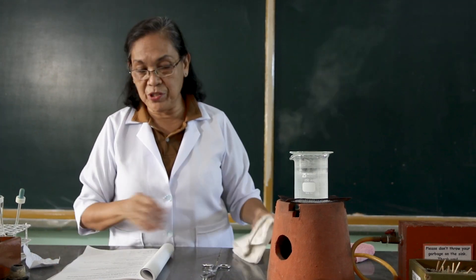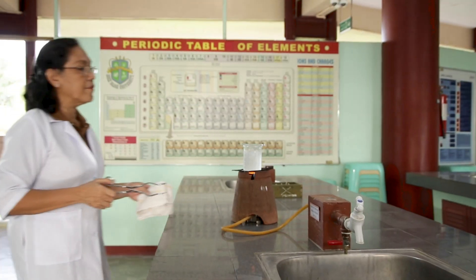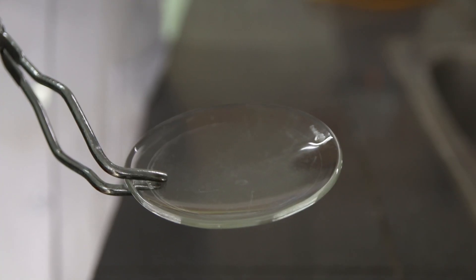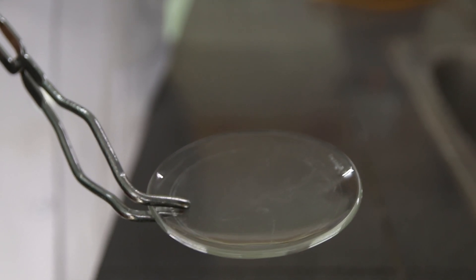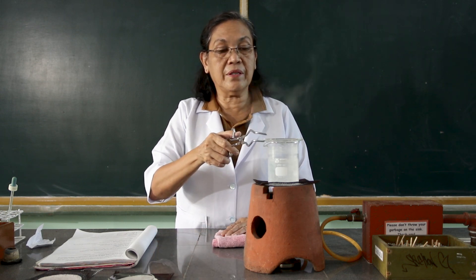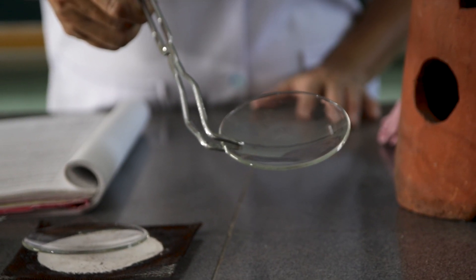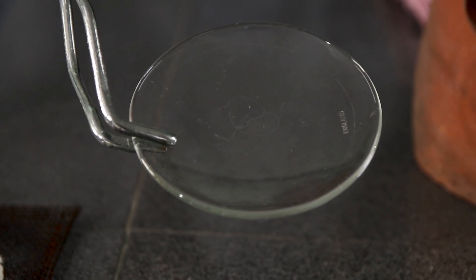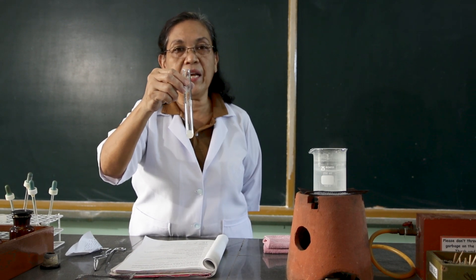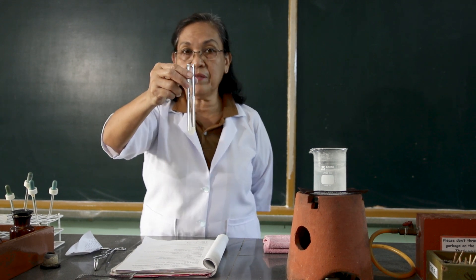So let's go back to the first procedure on knowing the properties of the starting material. This was the acetic acid that we evaporated off a while ago — I want you to observe. Then let us check the mixture of the acetic acid and ammonium hydroxide, which we allowed to evaporate a while ago. Observe what happens. This is the mixture of the calcium carbonate and acetic acid, which we allowed to settle for some minutes. I want you to observe what happens.